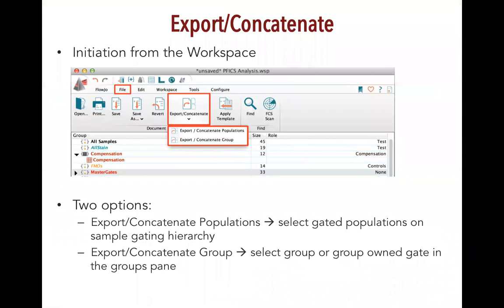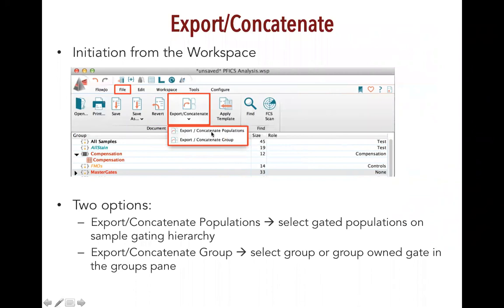Export and concatenate is the process of merging multiple files into a single file. It allows you to take several different samples or different tubes acquired on your cytometer and merge them together into a single new FCS-3 standard file. There are two basic options found under the file tab of your Flojo workspace, under the document band — export/concatenate populations or export/concatenate a group.